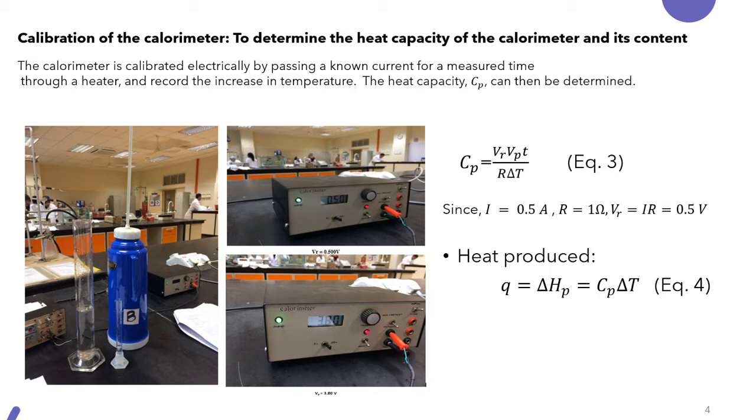Now to measure the heat capacity, this is the equation given in the lab manual. It is equivalent to the voltage, the potential, the time, over the resistance, and also the temperature change.